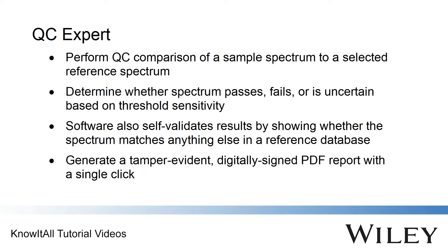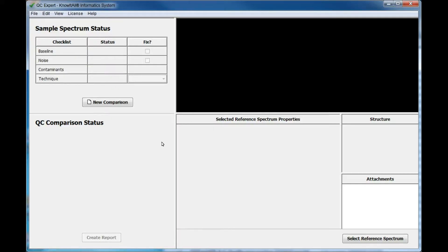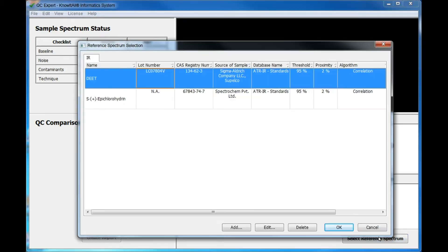Once you have performed your analysis, generate a digitally signed PDF report with a single click. First, the user selects a method defined by an administrator by clicking Select Reference Spectrum. Each row in the Reference Spectrum Selection dialog box defines a method for QC comparison previously defined by an administrator.